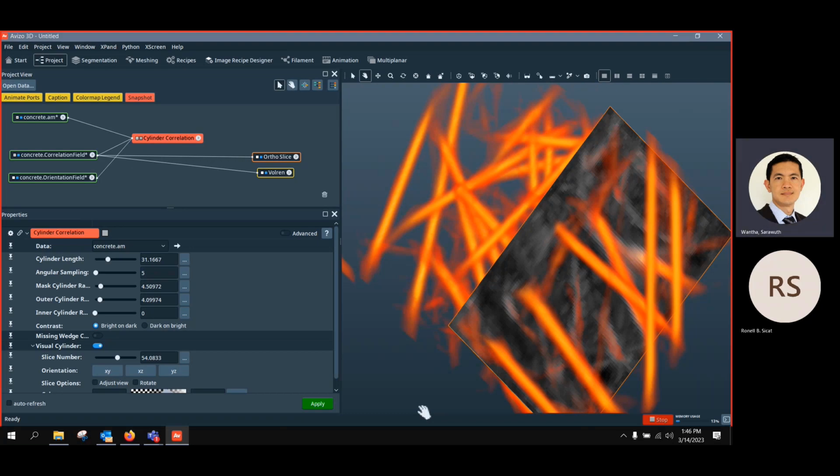At this seed point, you have to define the search cone: the angle of the search cone and the radius, how far you want to detect. For example, if we want to connect this line as a straight fiber line, you have to make sure the radius or angle is not too high, because otherwise it will detect something outside as well, if you have another fiber like this and also a seed point here.